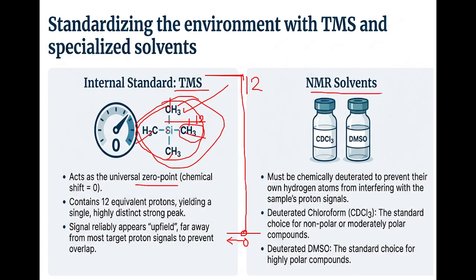Now, the solvents that we're using, ladies and gentlemen, for NMR, proton NMR specifically, should not have hydrogens in it. So we can't use water. Why is that? Think of it. If you're using water or chloroform, CHCl3, or DMSO, these hydrogens will take part in the NMR spectrum, and that's not what we want, because that is not a real NMR spectrum. It's a fake one. So what do we use?